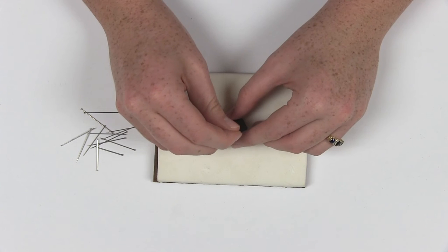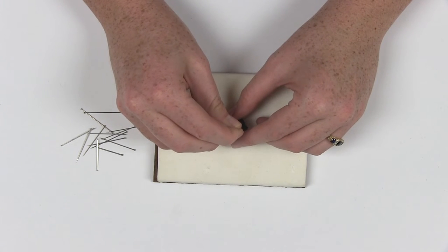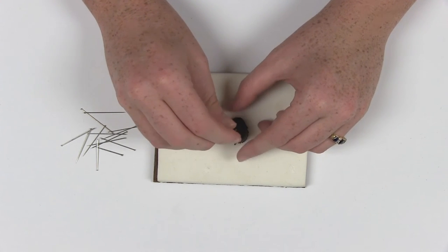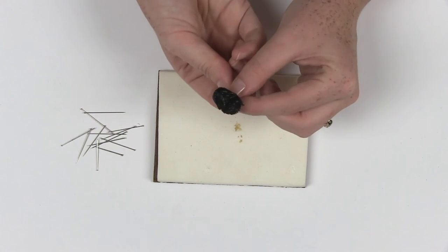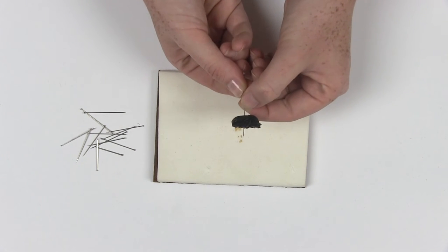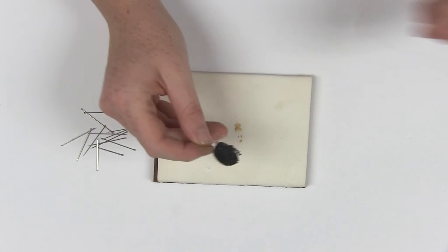Using your fingers or forceps, push the pin all the way through the insect and check that the pin is perpendicular to the body of the insect. The beetle should be one centimeter from the top of the pin.